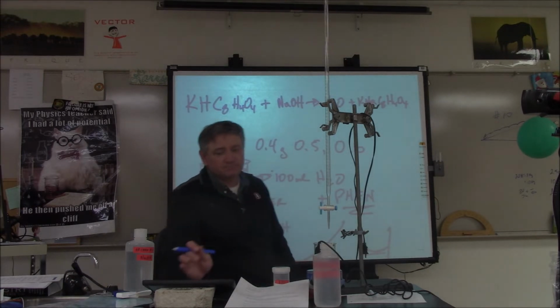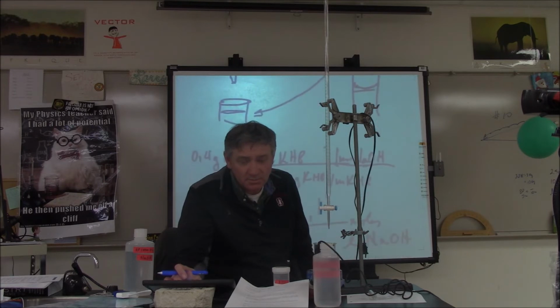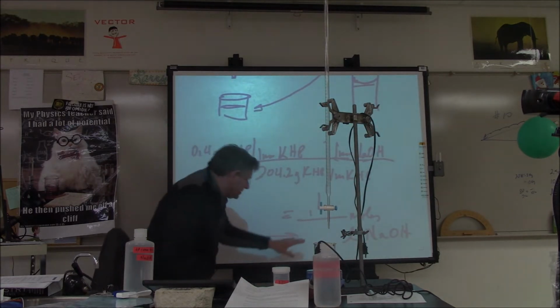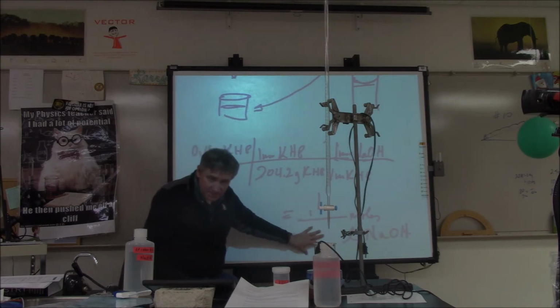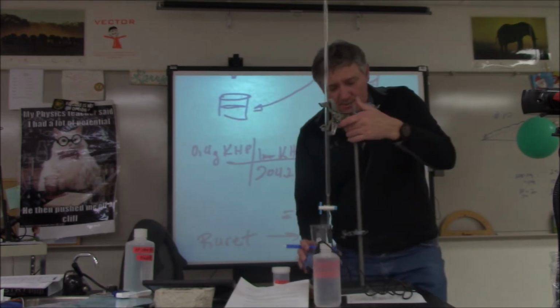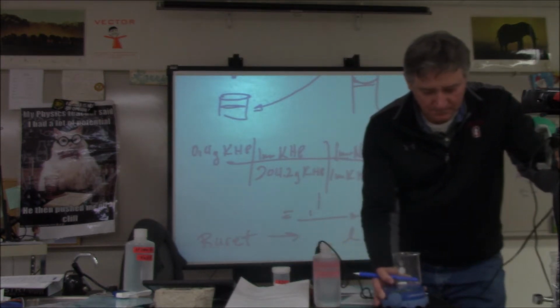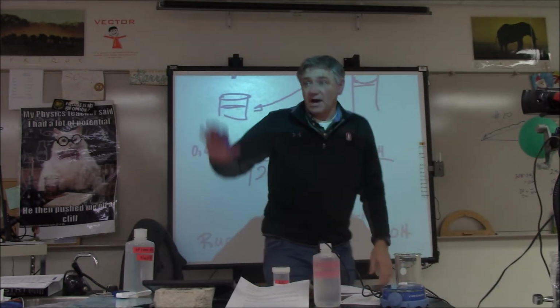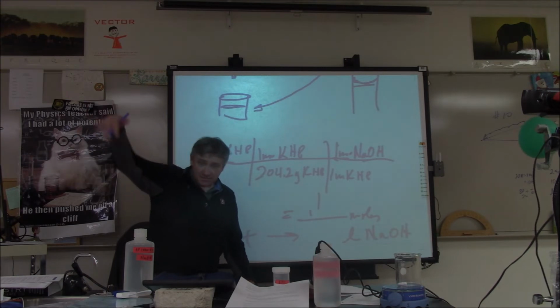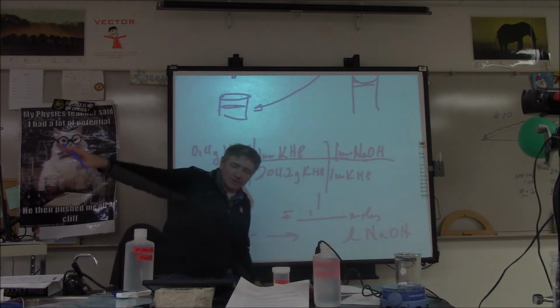All right. So here's the deal. Here's what you're after: the molarity of your sodium hydroxide. So let me move this out of the way so you can see the board. Now, I've also got this written up there on the board in the lab. This is all written on there, so if you don't write this down, it's written over there in the lab.